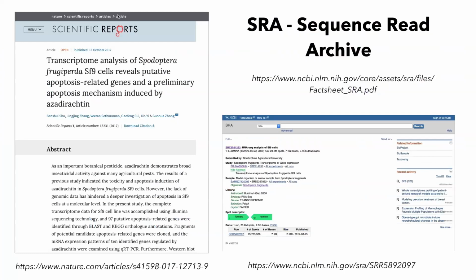So that's one of the things that we want to touch upon. We're going to be working on public domain data sets. And so I want to just briefly talk about where do you find a lot of this data. So there are several things that we need to understand about the data that is available on places like NCBI. A lot of the publications that you will be reading are going to include references to a published data set that was used to produce the results that we discuss in the publication.